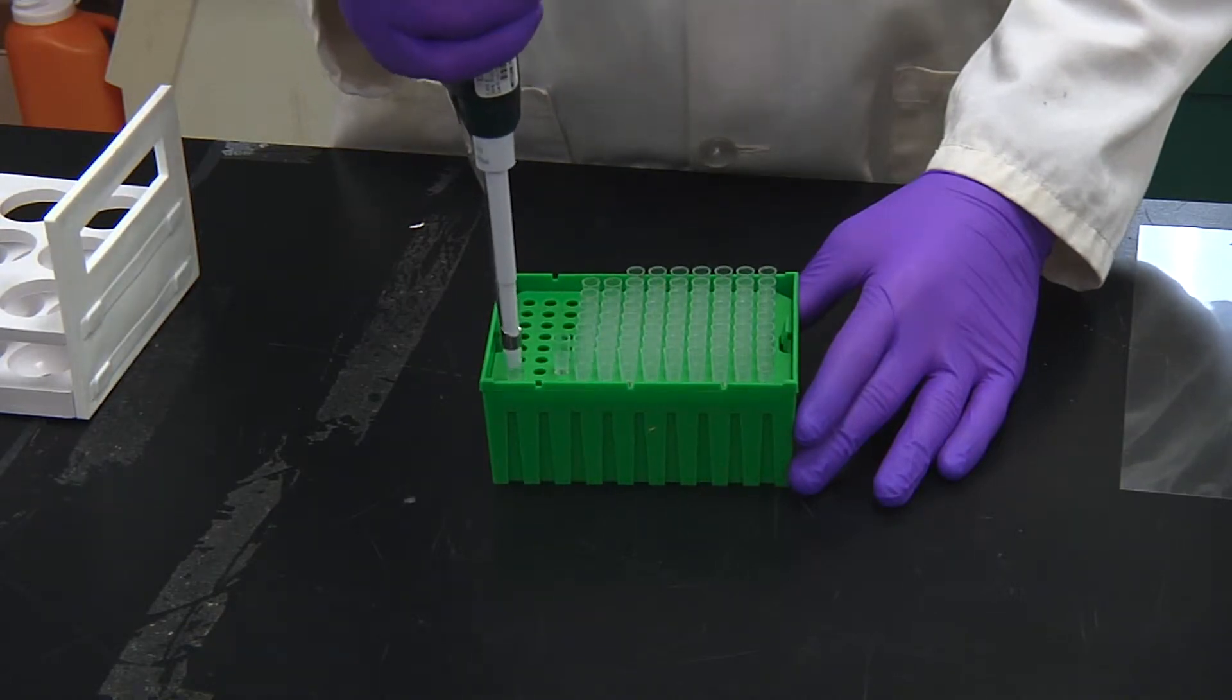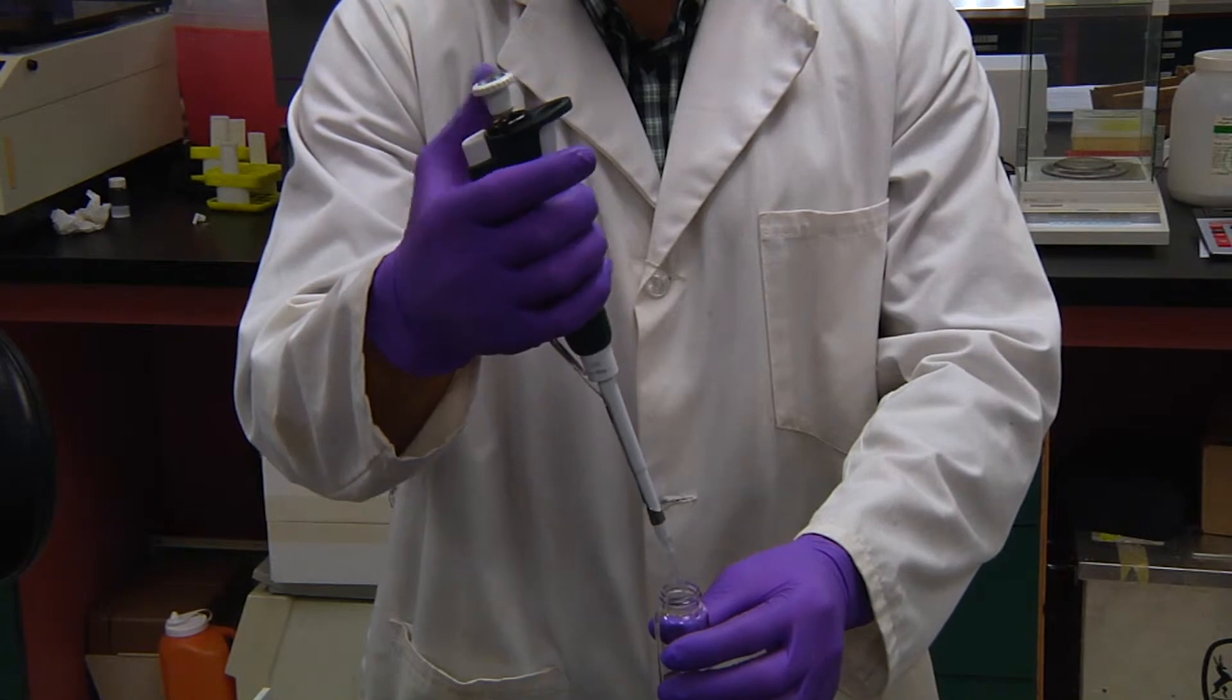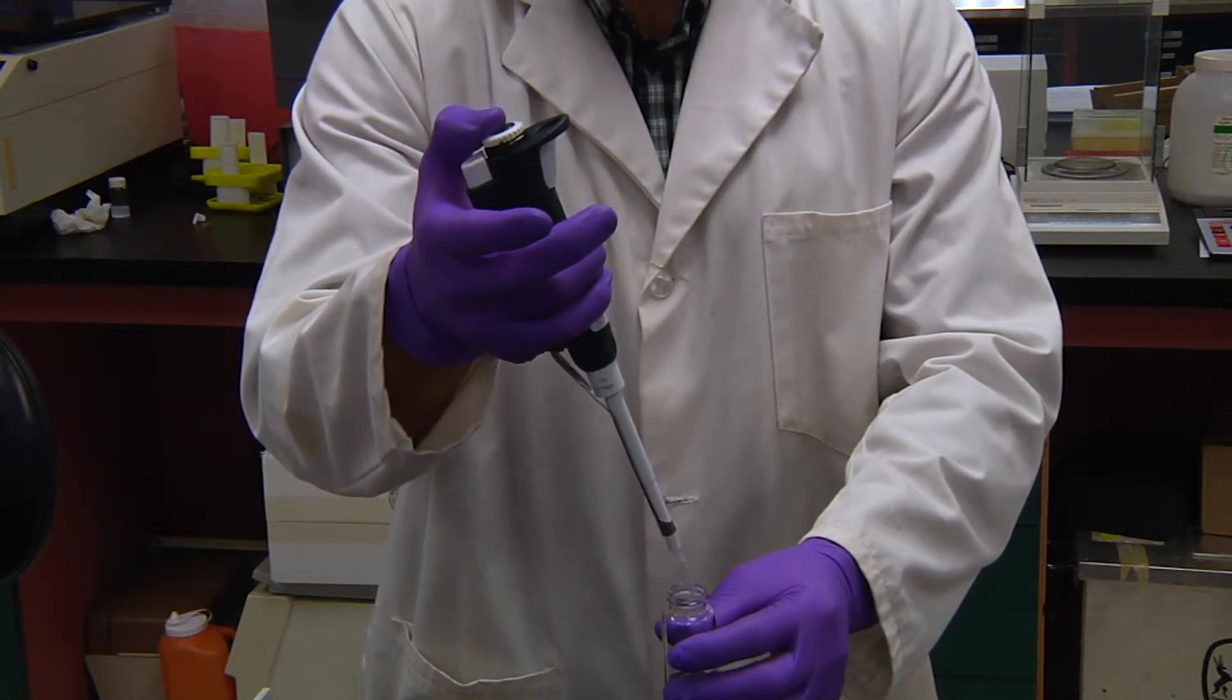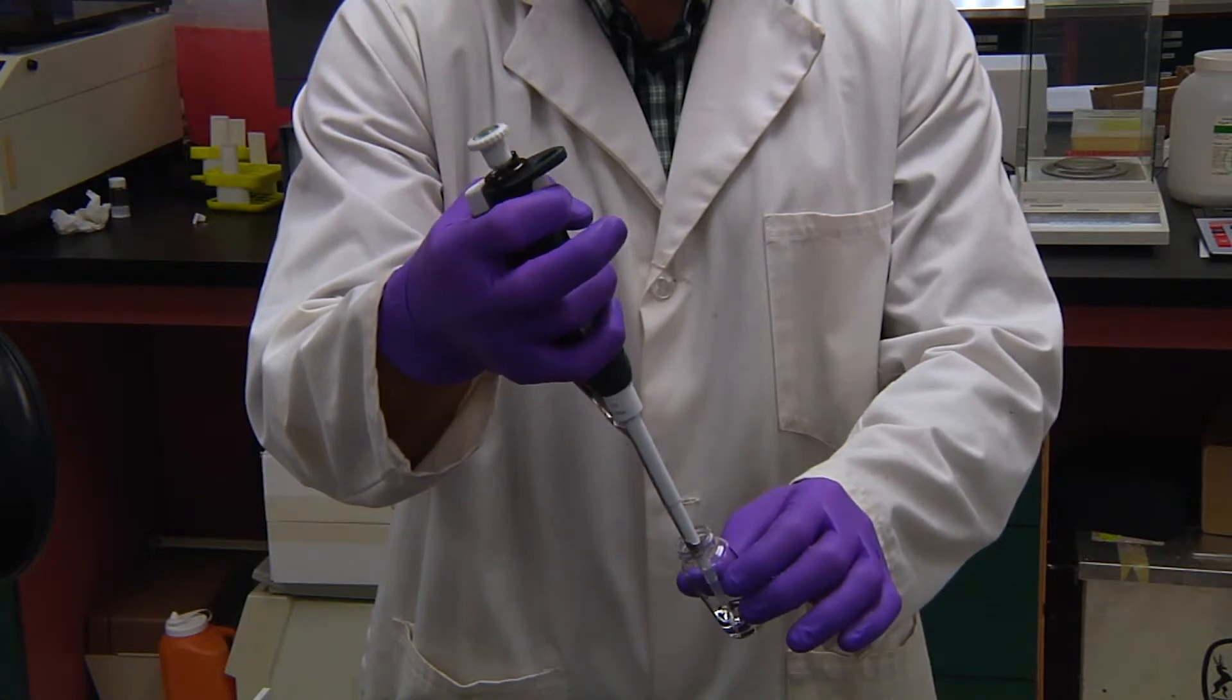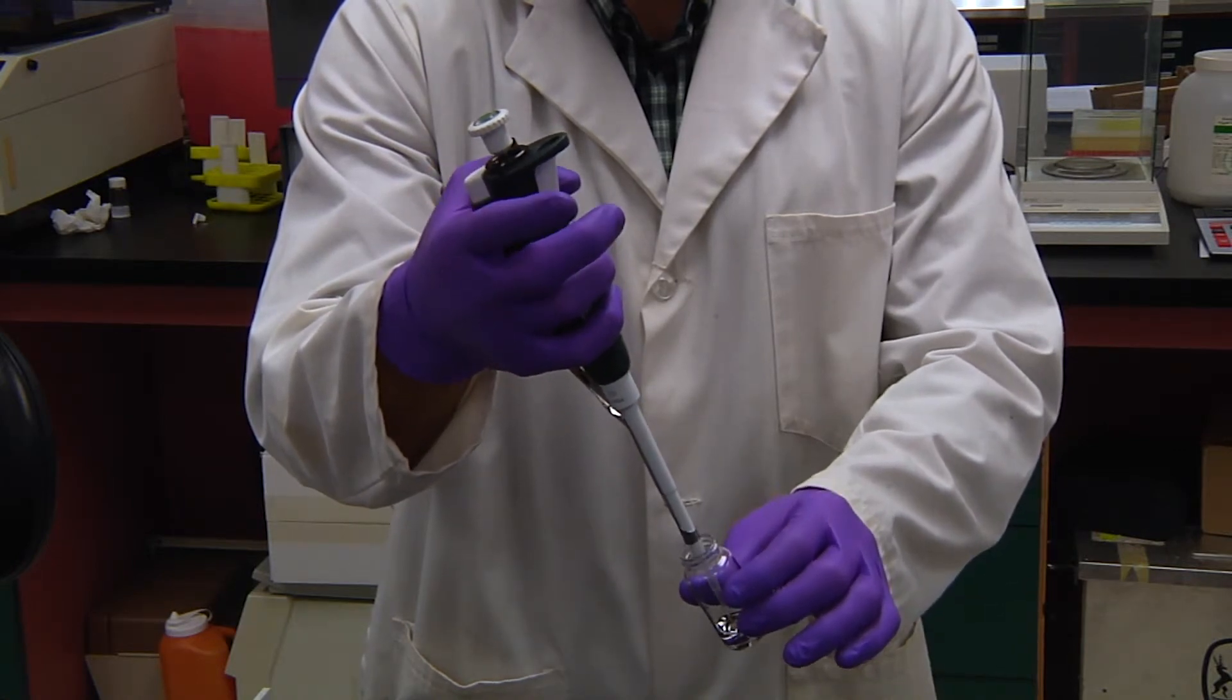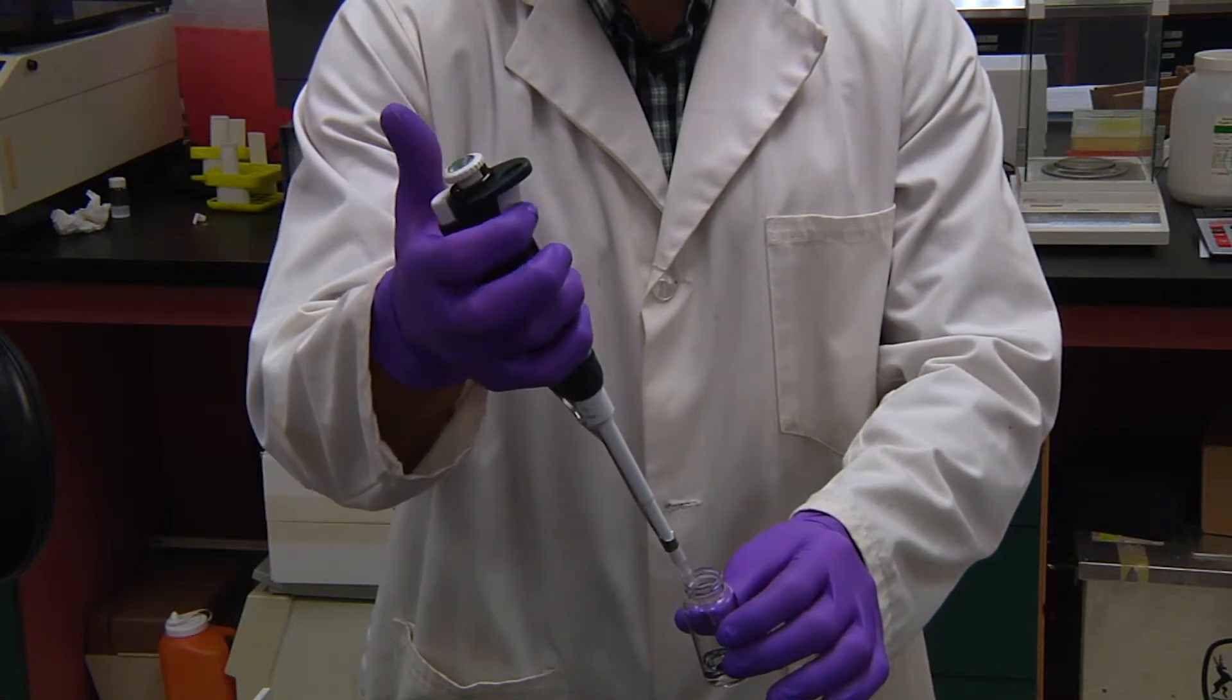When you're ready to use the pipette, load it with the tip, pressing firmly. This pipette uses the trigger to withdraw liquid. Press the plunger to ready the pipette to draw. Immerse the tip in the liquid and press the trigger to withdraw. Dispense by steadily pressing the plunger downwards until it fully stops.